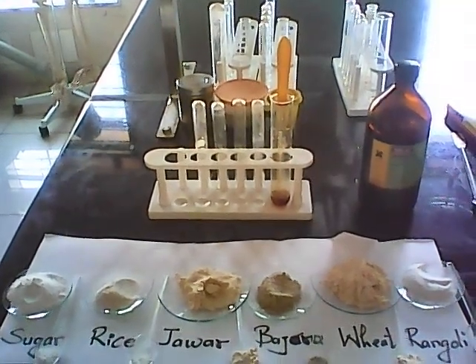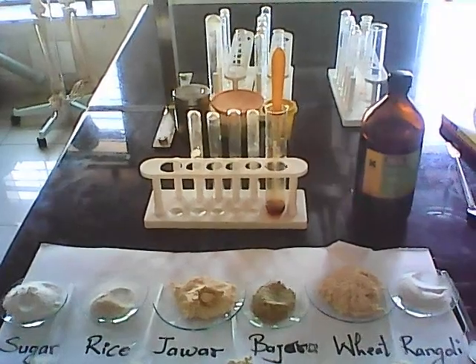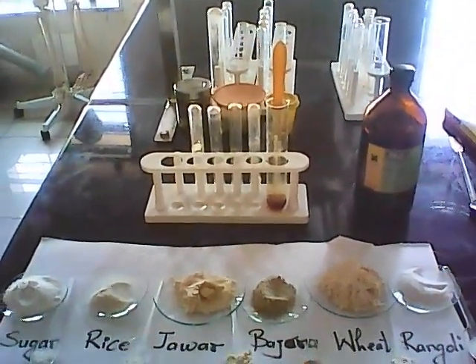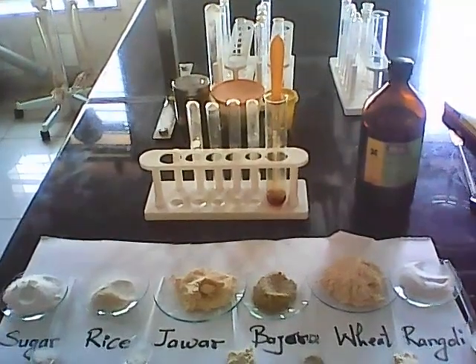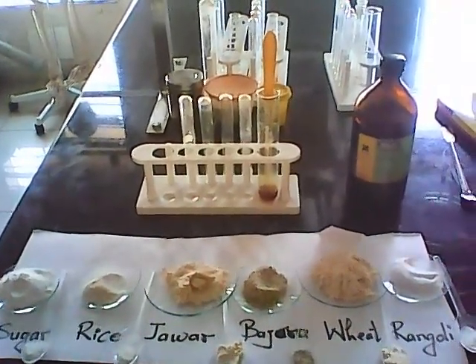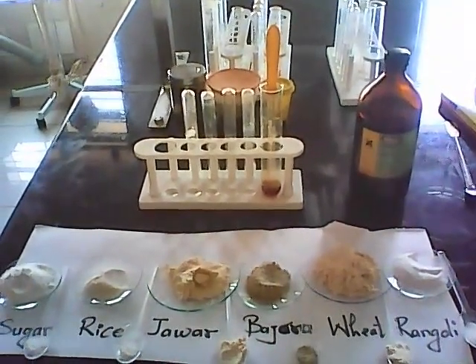Hello friends, here we are going to perform an activity to detect presence of carbohydrate in some sample of food. I will introduce some sample. Here you can see we have sugar, rice, jawar, bajra, wheat and a sample of rangoli is taken.